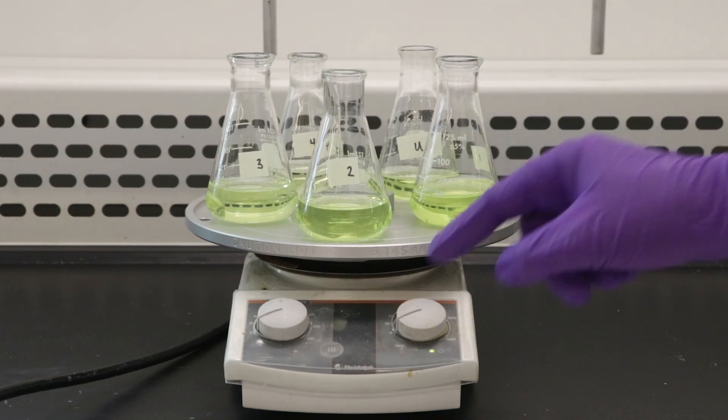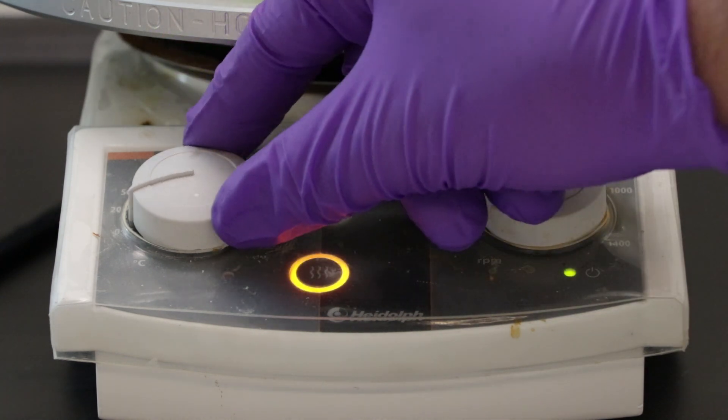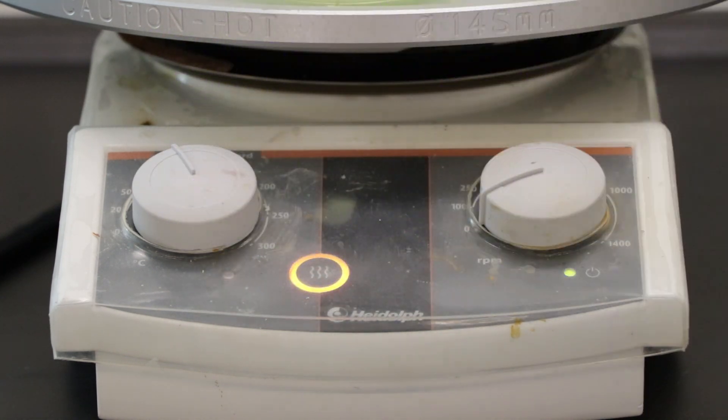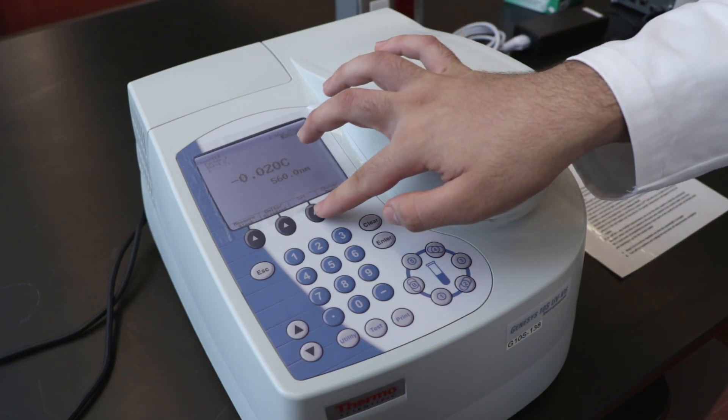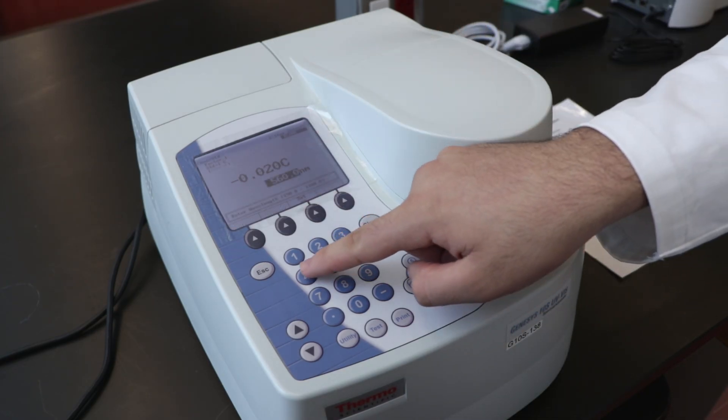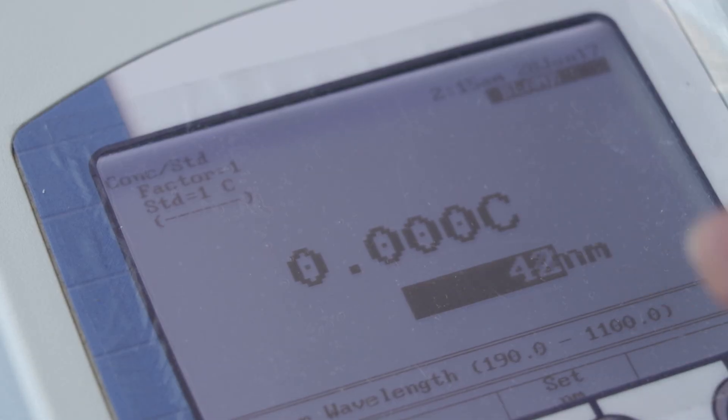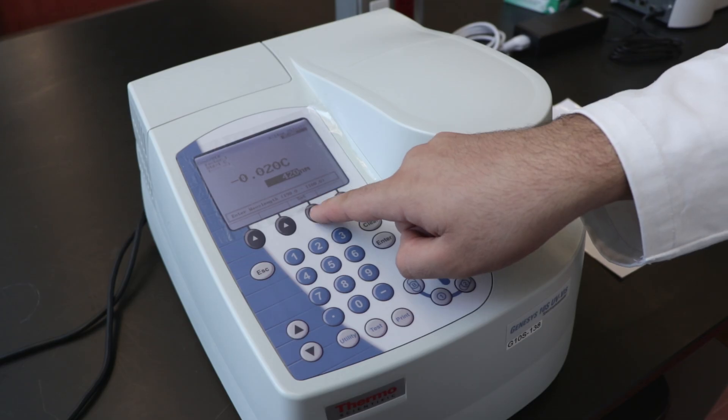Place all flasks on a hot plate and heat for approximately 15 minutes at a simmer. During this time, turn on the spectrophotometer to allow it to warm up. Set the wavelength to 420 nanometers. Read over the instructions on how to use it and remember to take your gloves off when using the spectrophotometer.